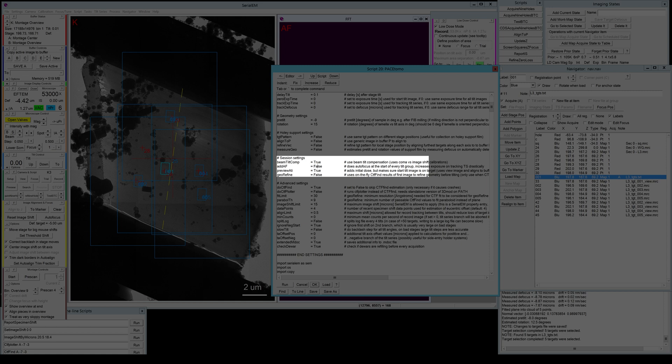Another setting is the preview alignment, and this I usually keep to true. What that does is once it tilts to the start tilt angle, it will actually quickly take a preview image of all your targets and make sure that they're still nice and centered. If you trust your image shift or if it's not so important to have exactly your feature of choice centered, you can also skip this to avoid this additional preview exposure on your target.